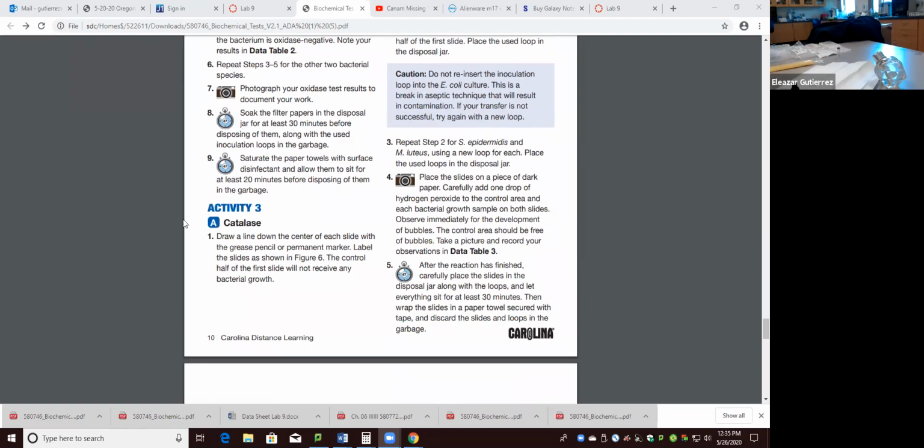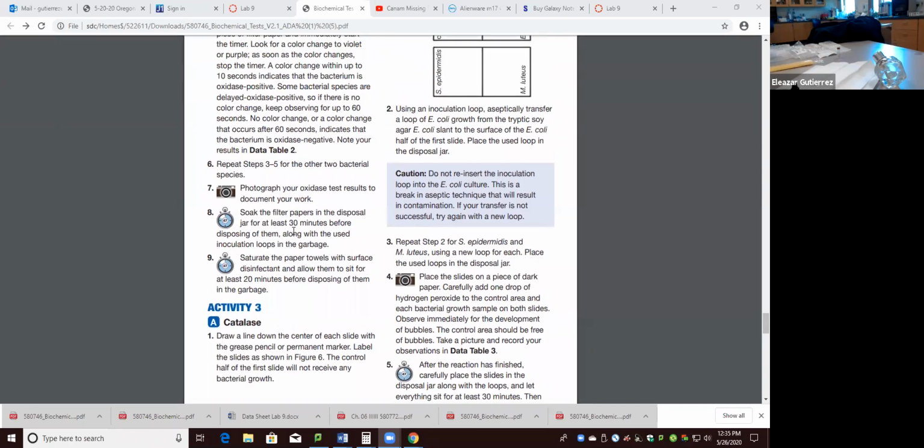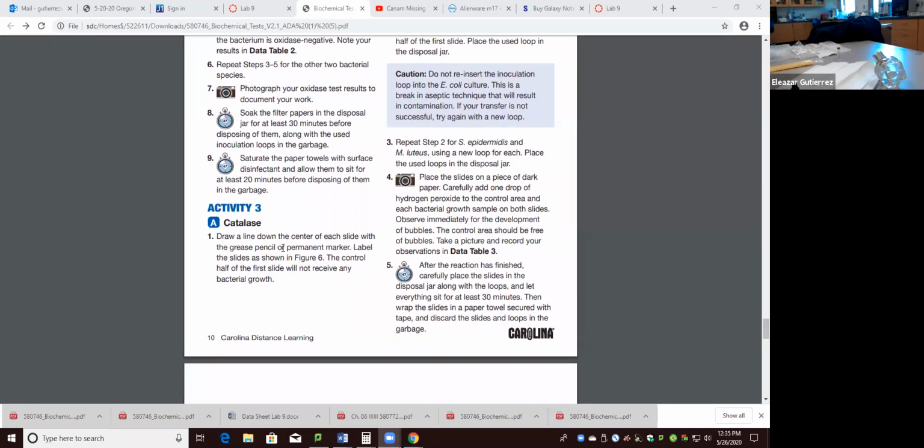So what is the enzyme? The name of the enzyme is catalase. You and I have this enzyme. How do we know? Well, when we put hydrogen peroxide on a cut, the catalase in our blood breaks that hydrogen peroxide into water and oxygen, because hydrogen peroxide would otherwise be poisonous to us. Does the same thing with bacteria. Some bacteria can defend themselves from hydrogen peroxide by producing catalase, and some bacteria cannot.